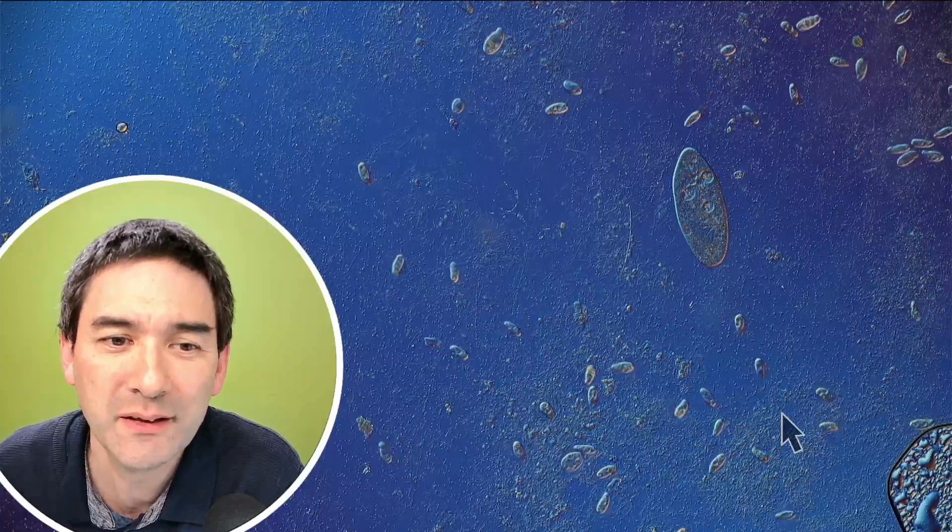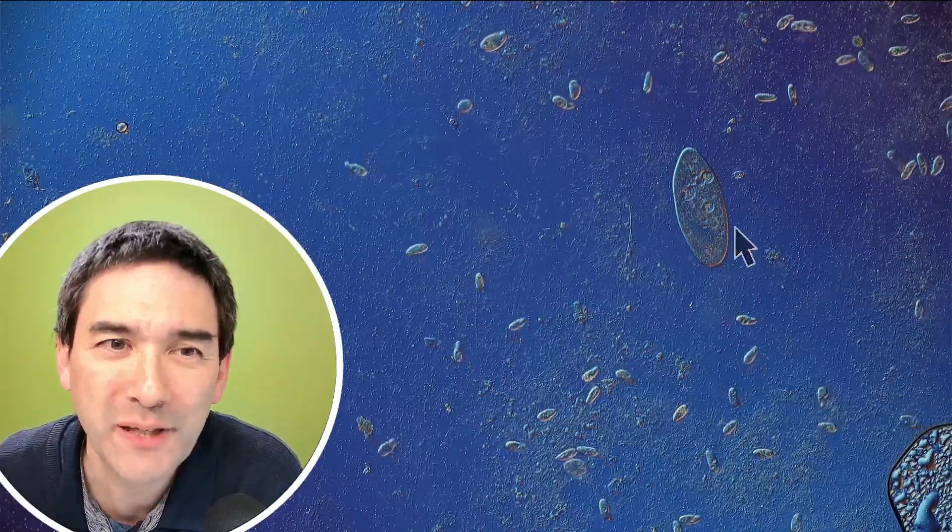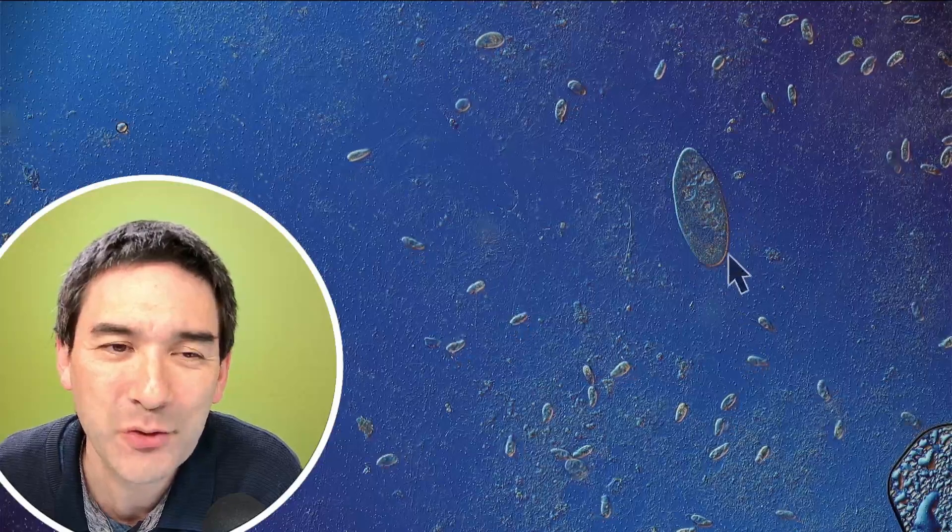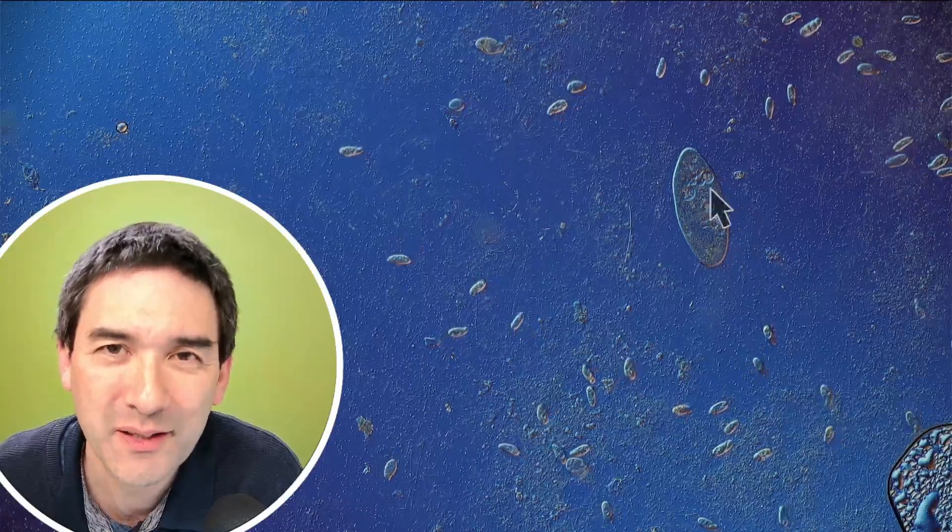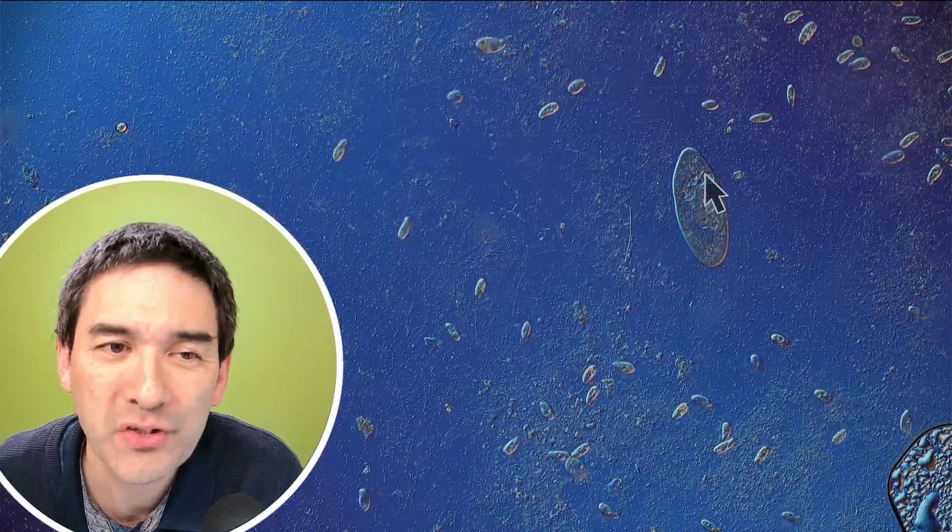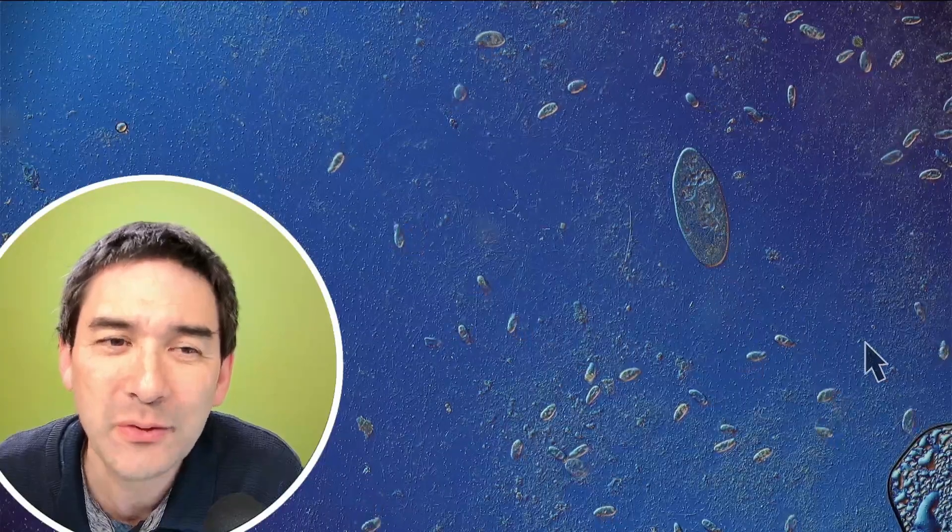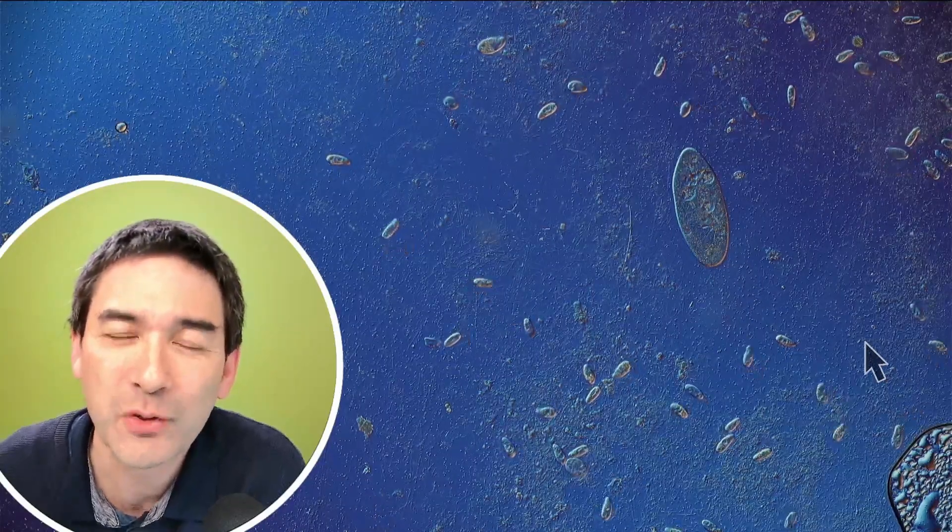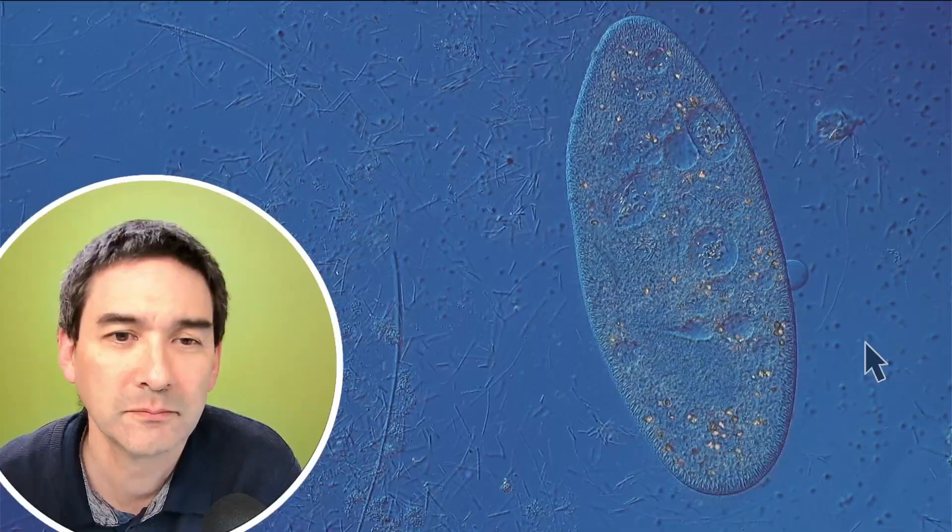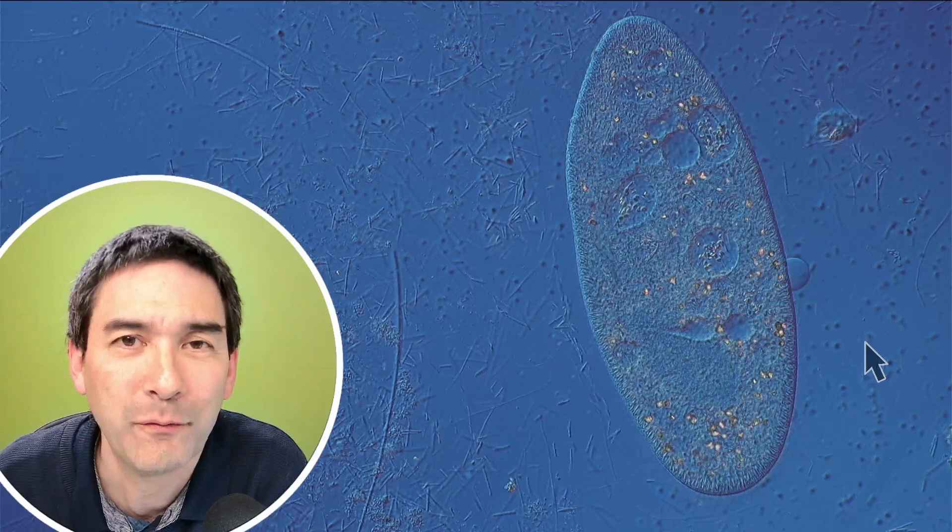Plenty of life here. What we're able to see are those somewhat small ciliates. And here, these are actually paramecia over here. They're not moving because they're compressed between the cover glass and the microscope slide. It's quite a tight space here. But actually that's good because now we are able to look into the cell much better. So let's go up a little bit with the magnification.